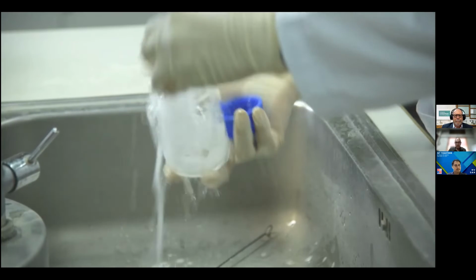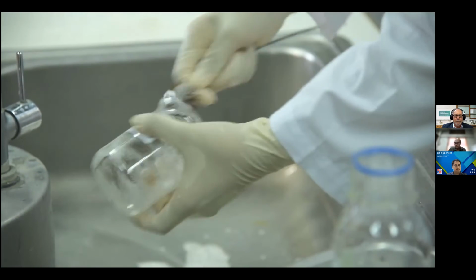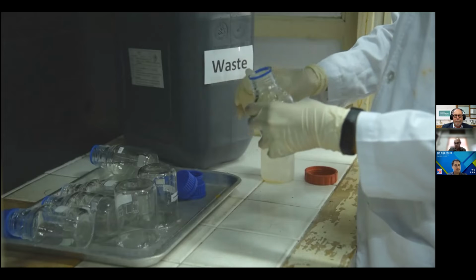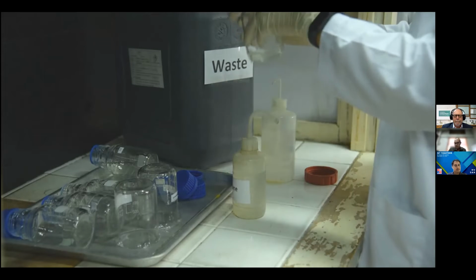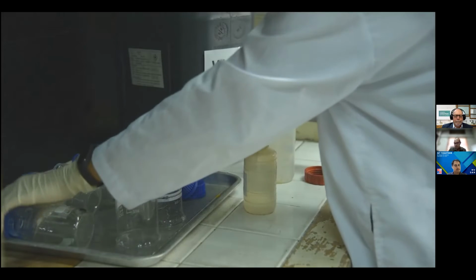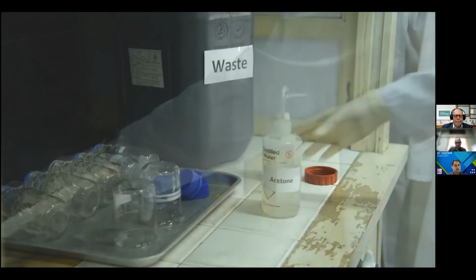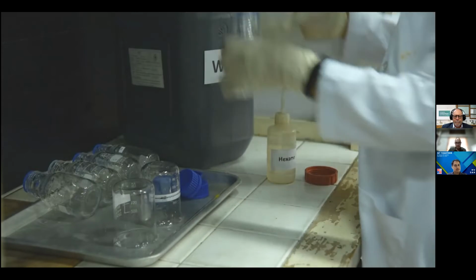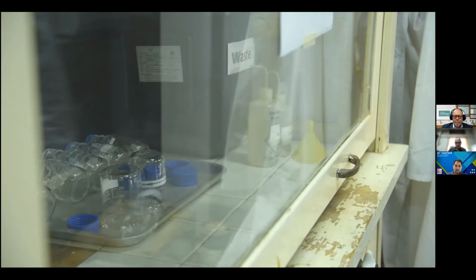Finally, clean the bottles. Wash the bottles with warm soapy water and rinse thoroughly with water at least 3 times. Then rinse the bottles and the caps with acetone. Let the bottles dry. Then, to ensure that the cleaning procedure is adequate, introduce some susceptible mosquitoes into the cleaned bottles. If there is higher mortality than in a control group in a known clean container after 2 hours, then repeat the washing and drying.